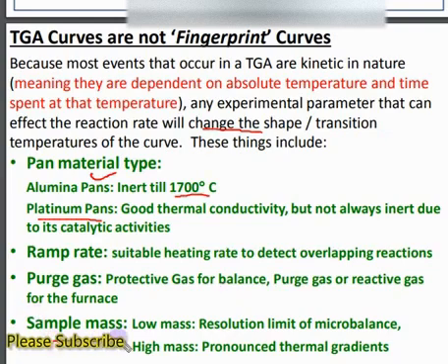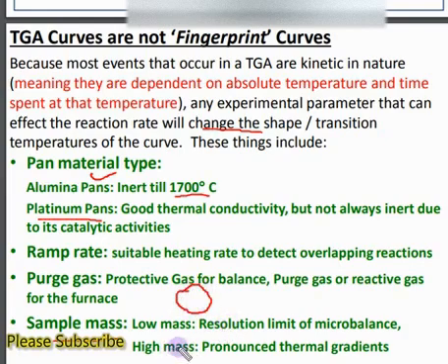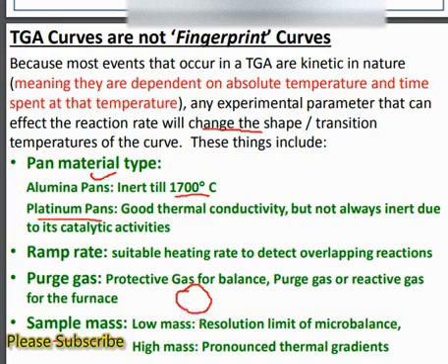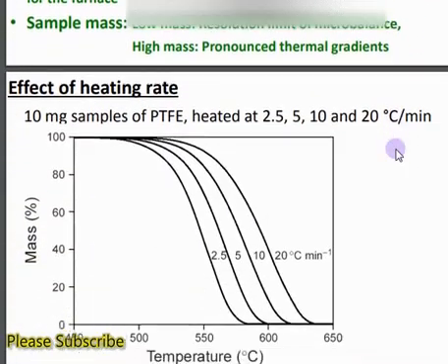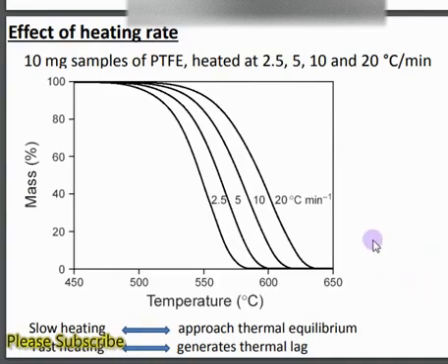Sample mass has a great influence on TGA curves. If we have a higher mass, there will be a thermal gradient developed. Conversely, too low a mass causes resolution limits of the microbalance. We have to maintain a minimum mass so that we can get well-resolved peaks for a particular sample.